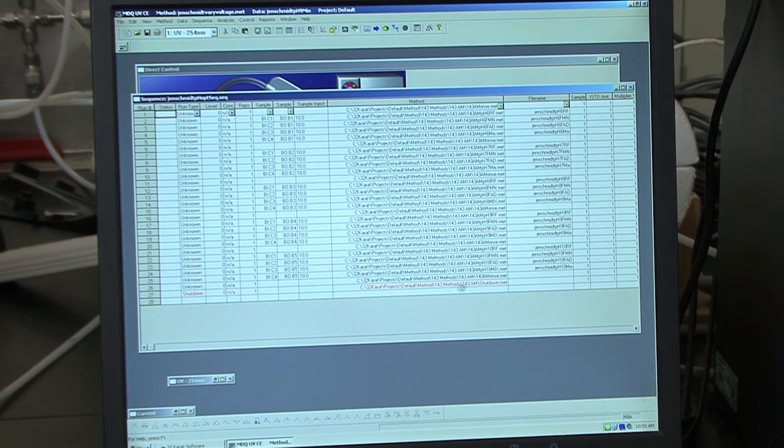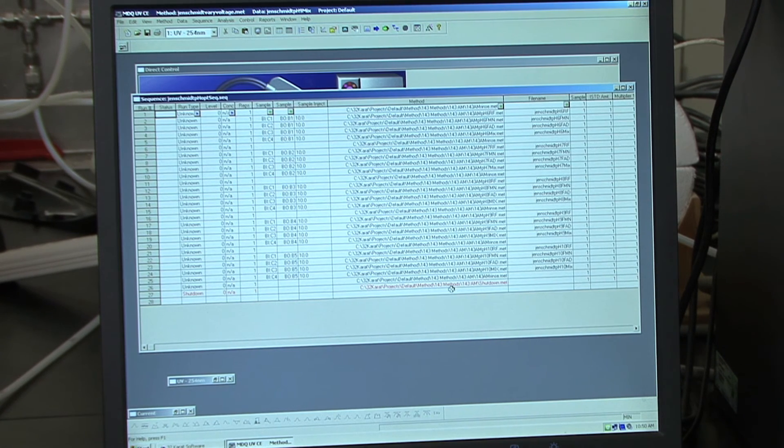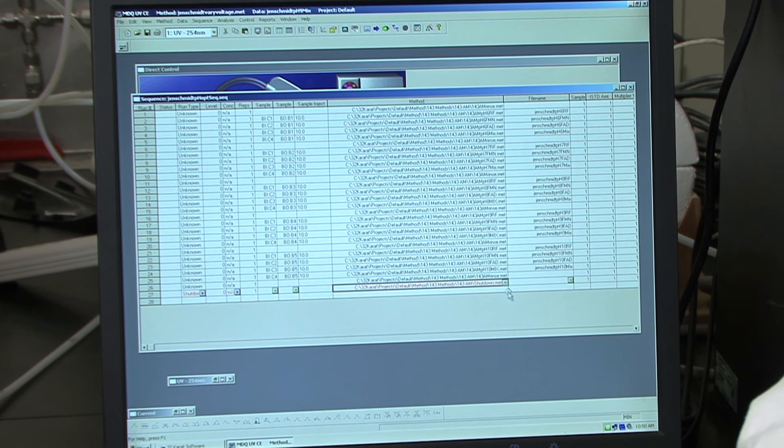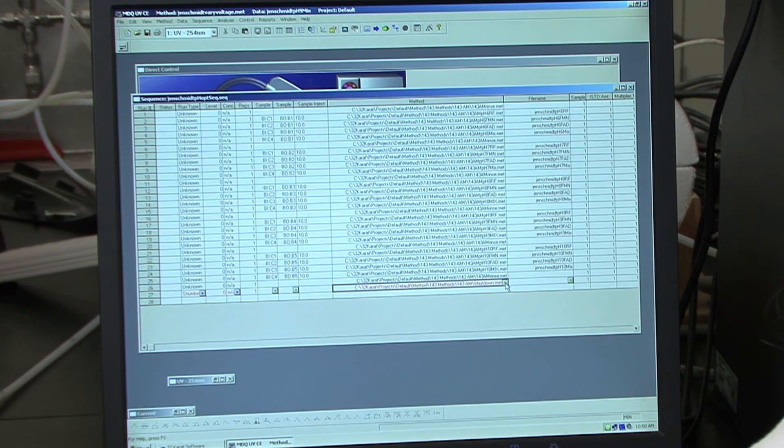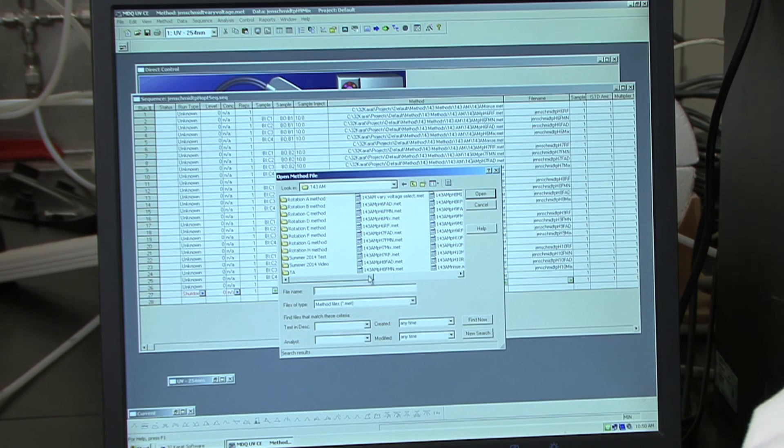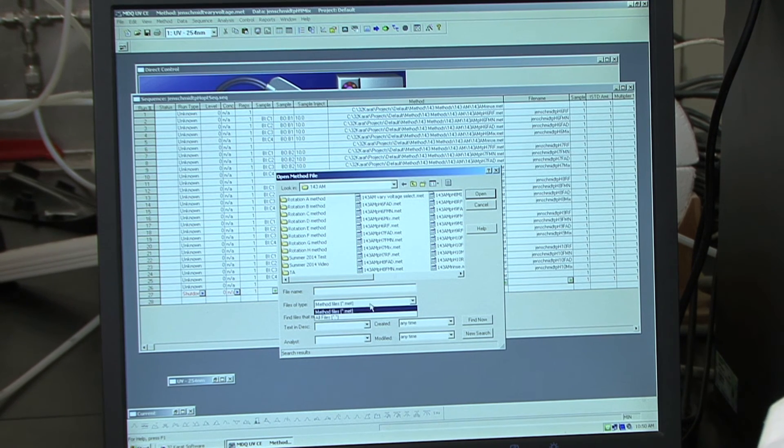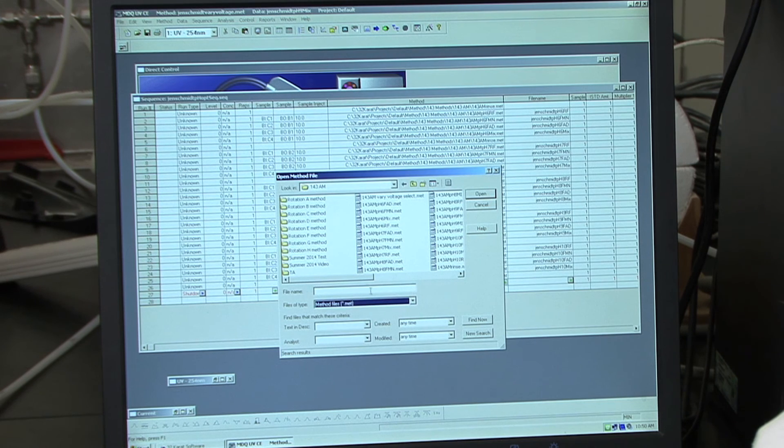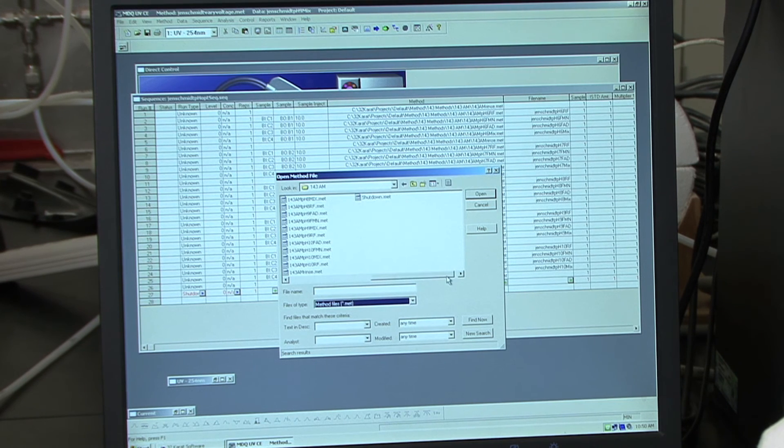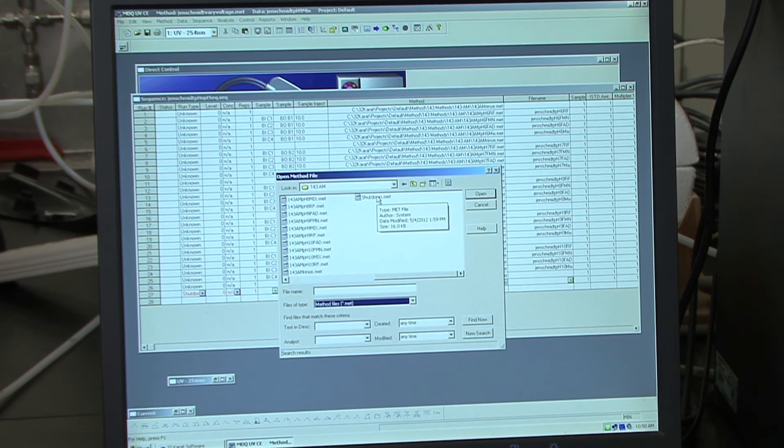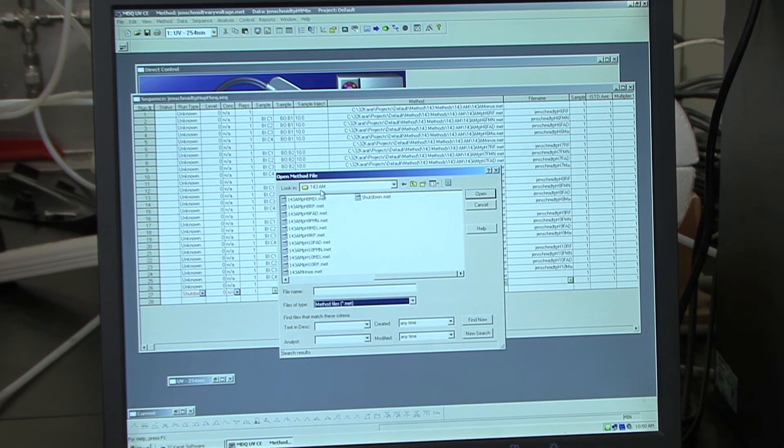One final thing to note is after you have loaded all of your pH 10 samples, you need to load a shutdown program. So to do that, you again will just click on the green diamond. And it will just be the shutdown method, which is the last one listed in the 143 AM folder.